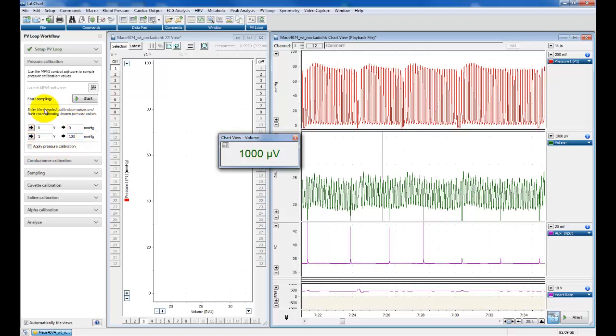And these are not the numbers that the MPVS unit sends you as a default calibration, but these should be numbers that you calibrate your catheter using a sphygmomanometer, mercury manometer, to actually calibrate. Don't rely on what the computer sends out, because that's going to be a default value of 0 and 1. You may find that over time your transducer loses calibration and these numbers aren't the same. So now we can apply the calibration, and as we click apply it's recalibrated this top channel here in red, but you can see there's no change in the numbers because they were already calibrated to these numbers.